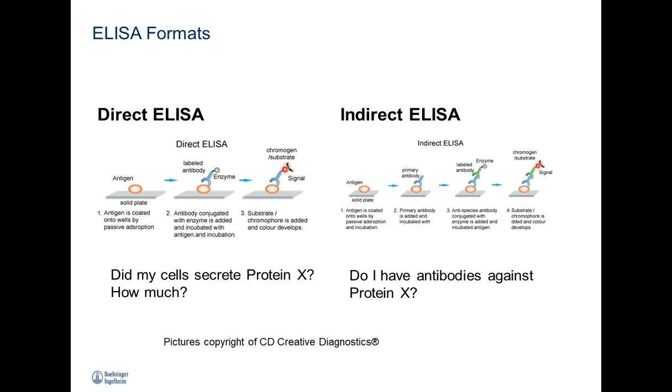Indirect ELISA delivers greater flexibility since different primary antibodies can be used. Among the disadvantages is a possible cross-reactivity of secondary antibodies to the adsorbed antigen, which could increase your background noise. Also, indirect ELISAs can take longer to run than direct ELISAs since additional incubation steps are needed. The indirect ELISA is usually most suitable for determining total antibody concentrations within a sample.